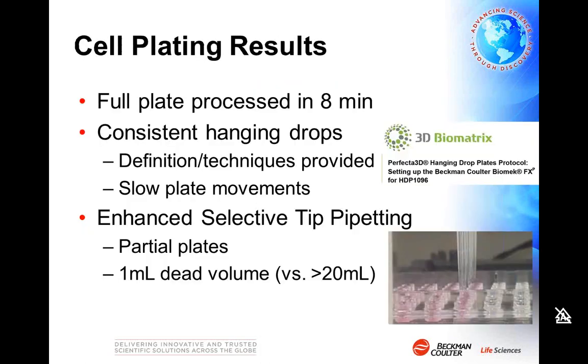So the result of this stage is that we were able to process a full plate using this technique in less than 8 minutes. We did find that we were able to achieve consistent hanging drops, and that was due in large part to the plate definition and pipetting techniques that were provided on the 3D Biomatrix website. As Nikki alluded to, there's a vast amount of resources for working with these plates, including how to use them proficiently with the Biomek FXP.